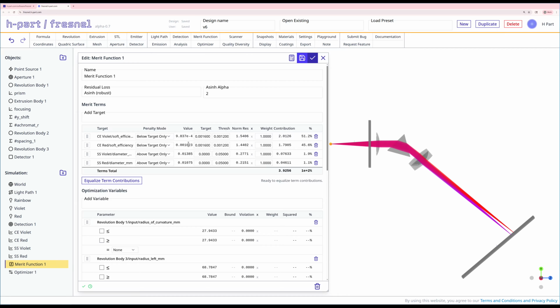Now we did lose a little collection efficiency because we put in this achromat, and given our wavelength range, we could get some of that back with anti-reflective coatings. But I'm happy with how we're doing right now, and I think that this is good enough.